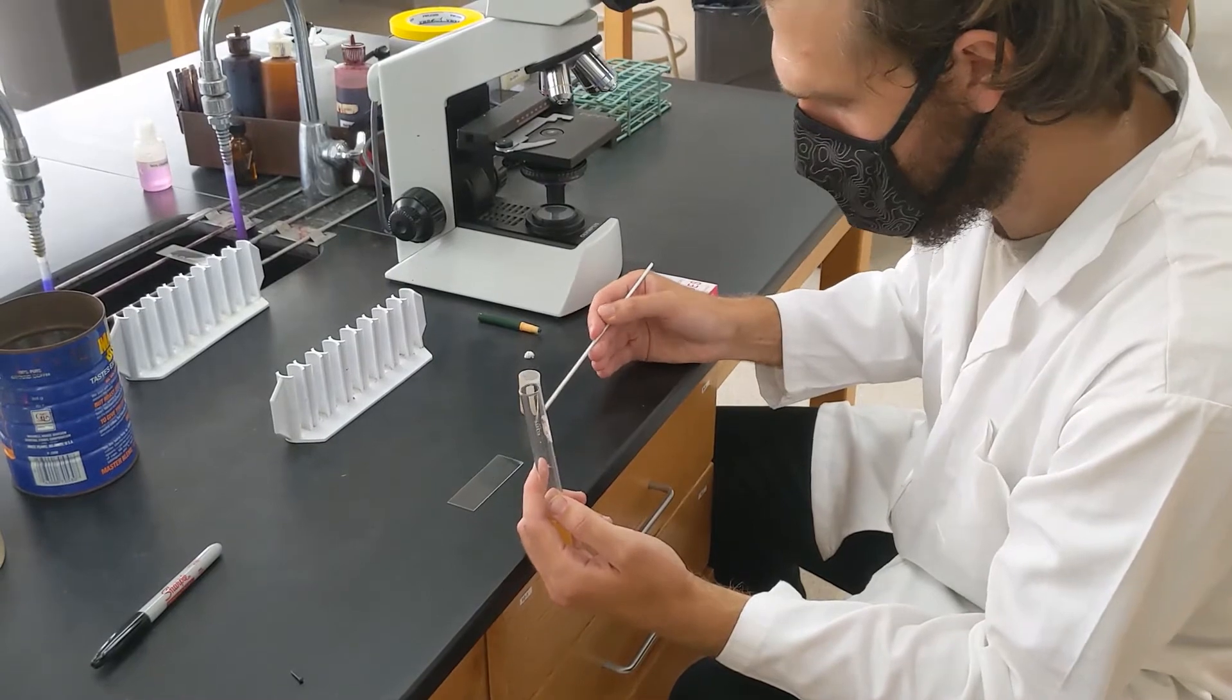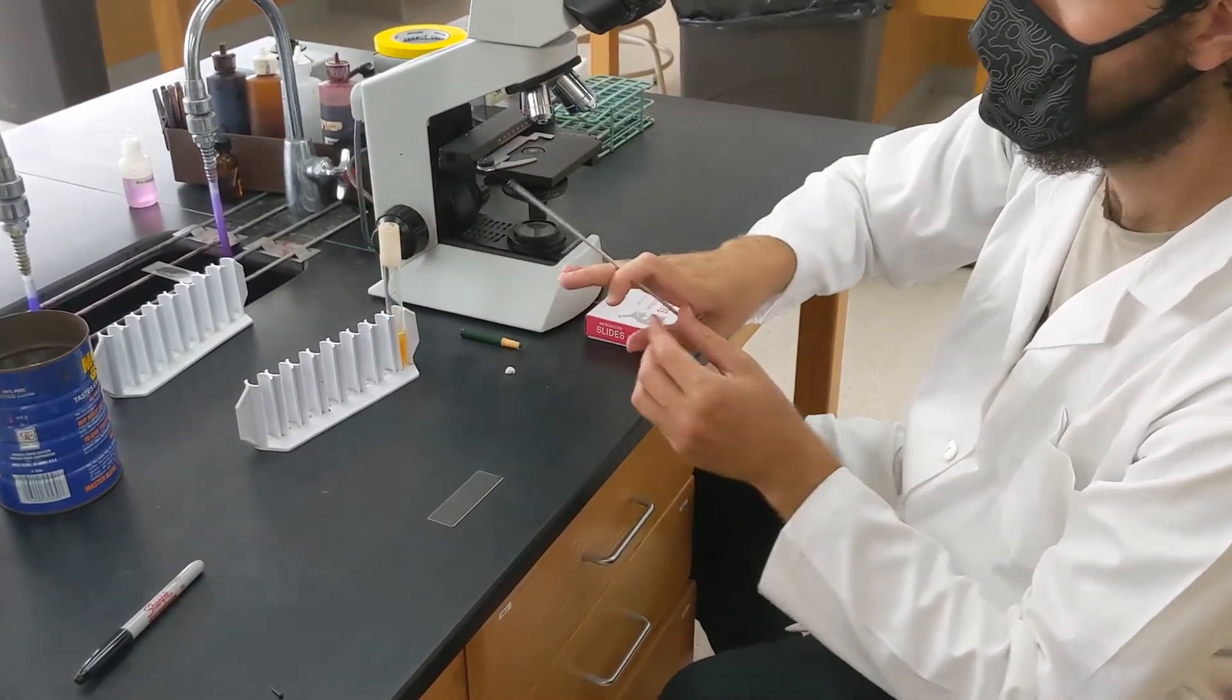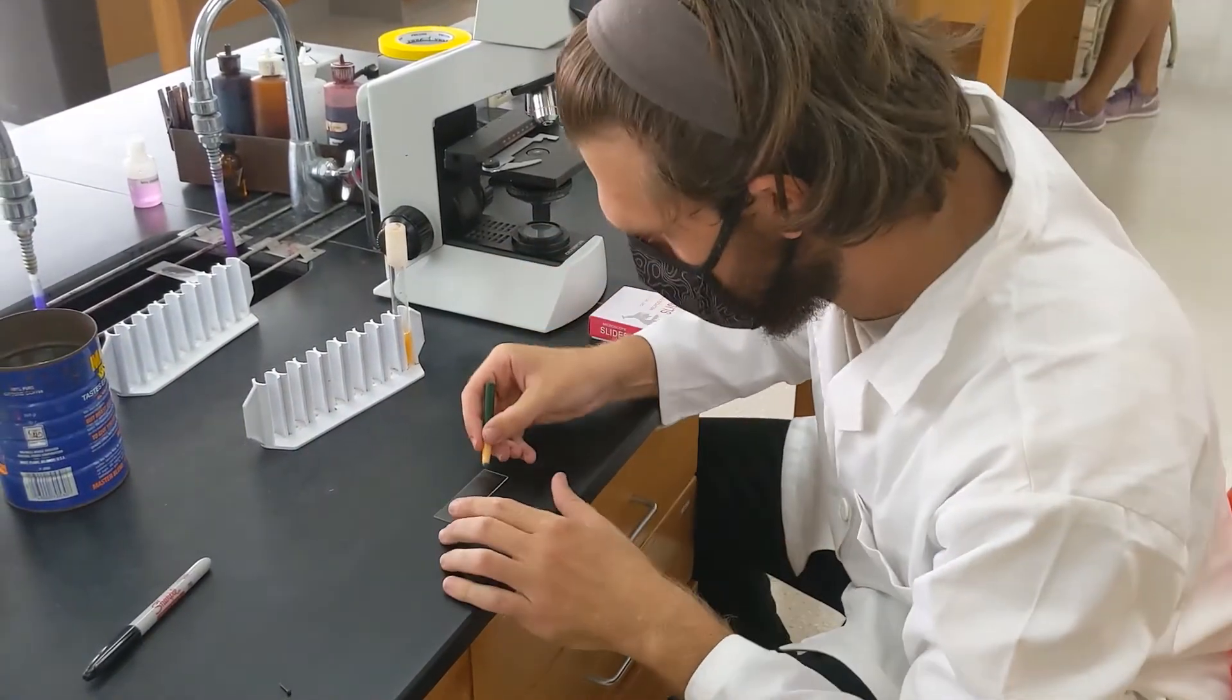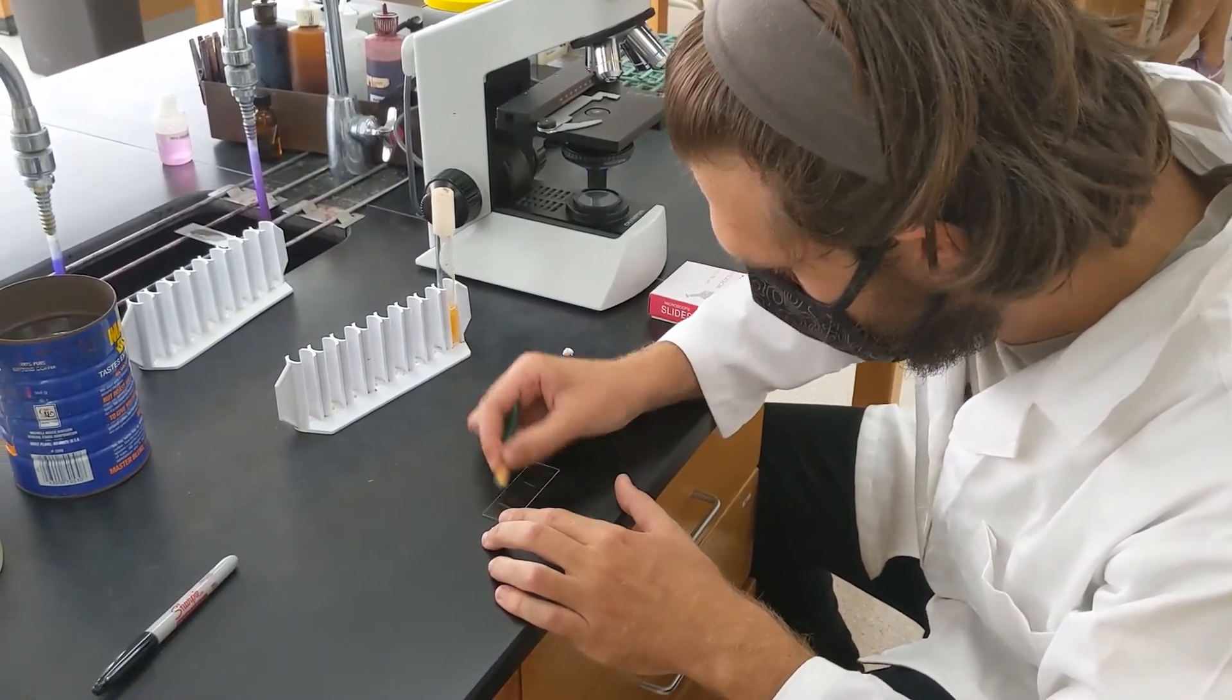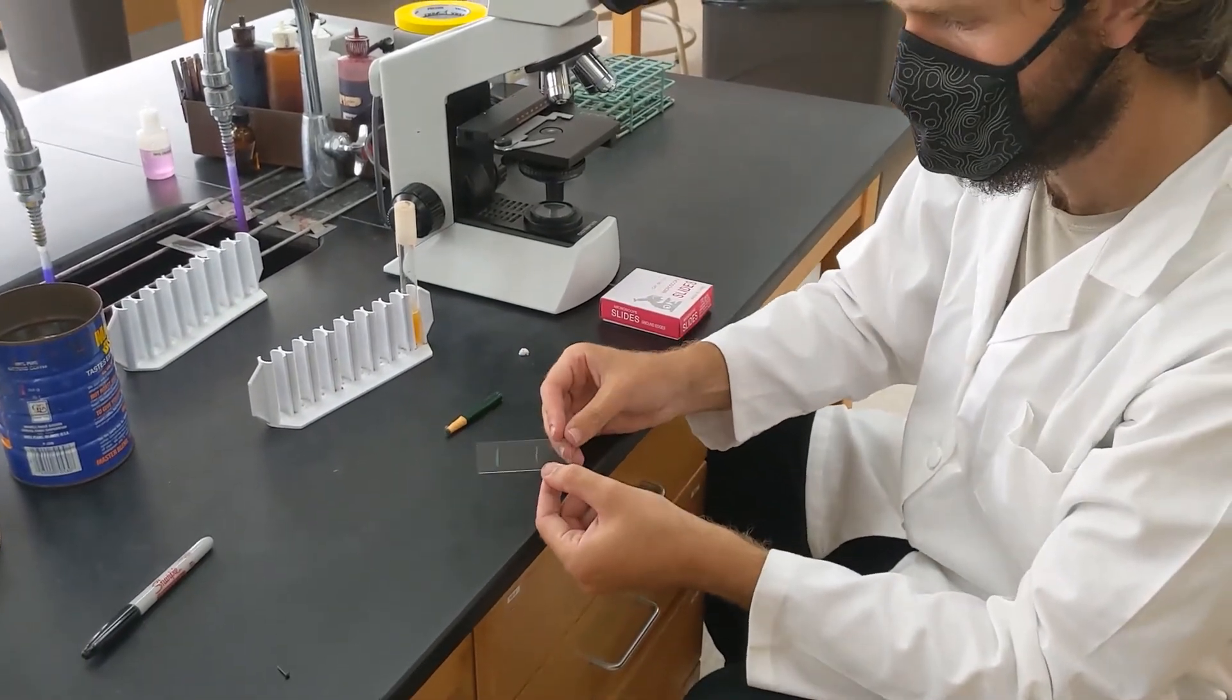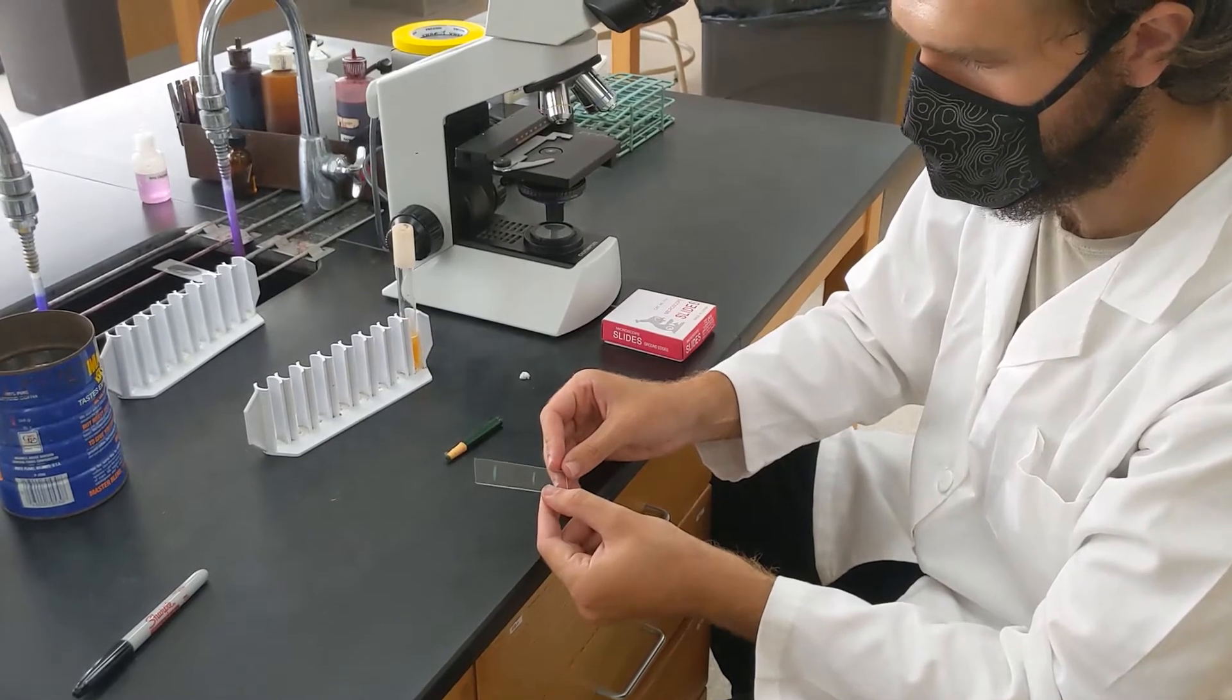Wherever you do end up spreading the sample, it's helpful to mark it off, to mark off the area. So what I'm going to do is use this wax pencil and just draw little boundaries roughly where I've streaked out the sample. This way I know in the general area where I should be focusing with the objective lenses.